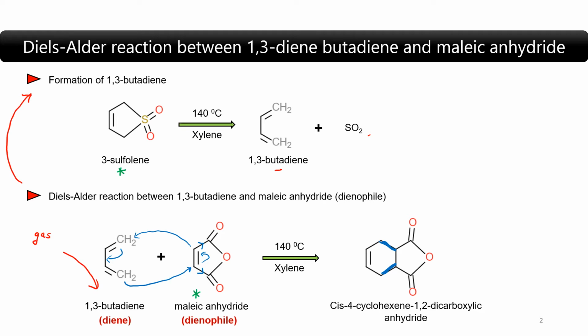Now, all of these reactions are performed in this solvent called xylene, which you haven't seen before in our class. We were used to diethyl ether, dichloromethane, those kinds of organic solvents, but those have a very low boiling point, so they're not suitable for this reaction because we need to achieve high temperatures to allow these reactions to actually occur.